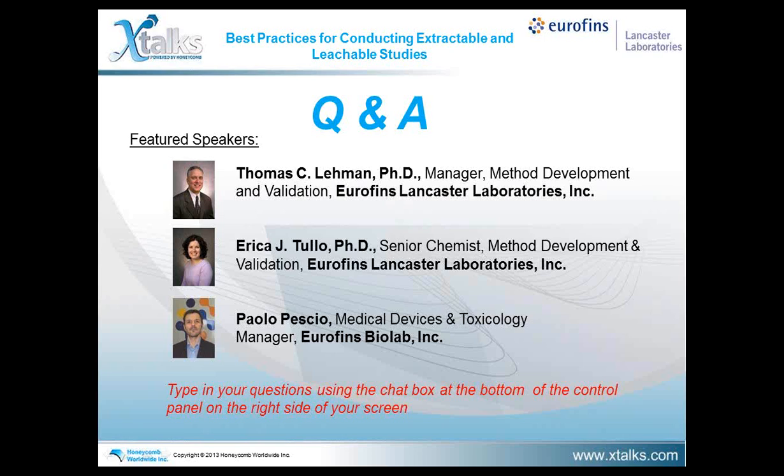So what you may want to do in this case is evaluate the materials of contact. Typically glass containers are considered one of the lowest risks. It doesn't mean they're completely no risk, but also frequency of administration of the product, shelf life of the product. And I think an appropriate risk assessment has to be done. I've seen many cases where drug product manufacturers have justified not performing extractable studies on those materials, but there's also plenty of references in the literature to that type of material also being adulterated by leachables.